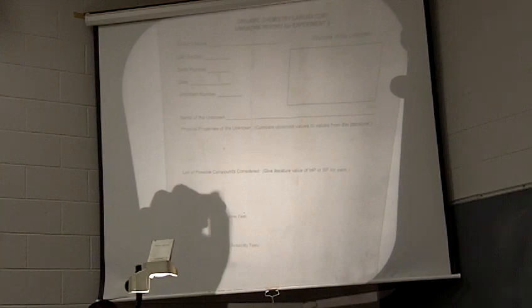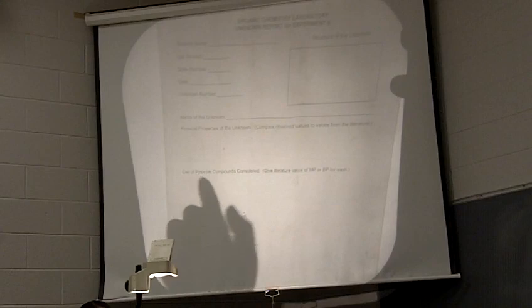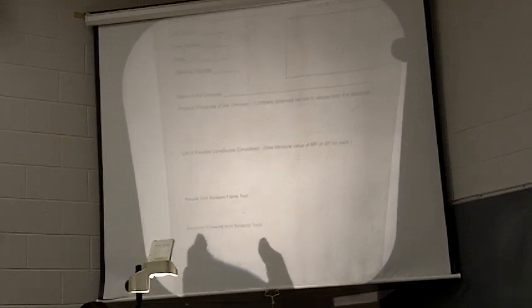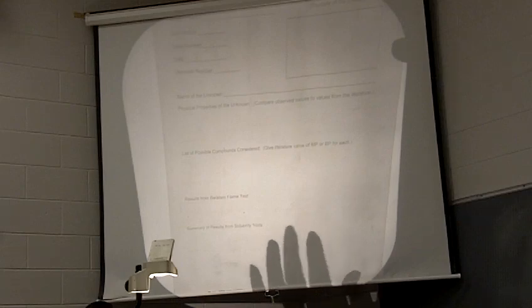So what are those plus or minus 10 degrees from your melting point and boiling point? What are they and what is their boiling point or melting point? Give the flame test information. Was it positive or negative? What kind of flame did you get? Give the results of your solubility test. You could use that table as an example, draw the table, and then put some comments about solubility.